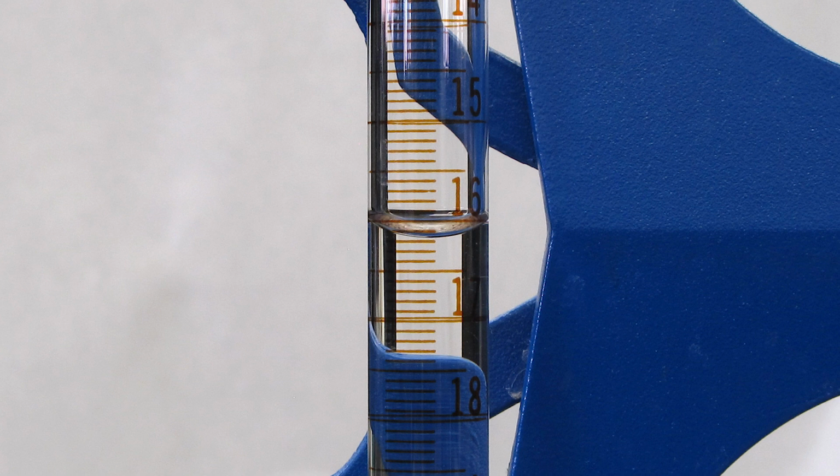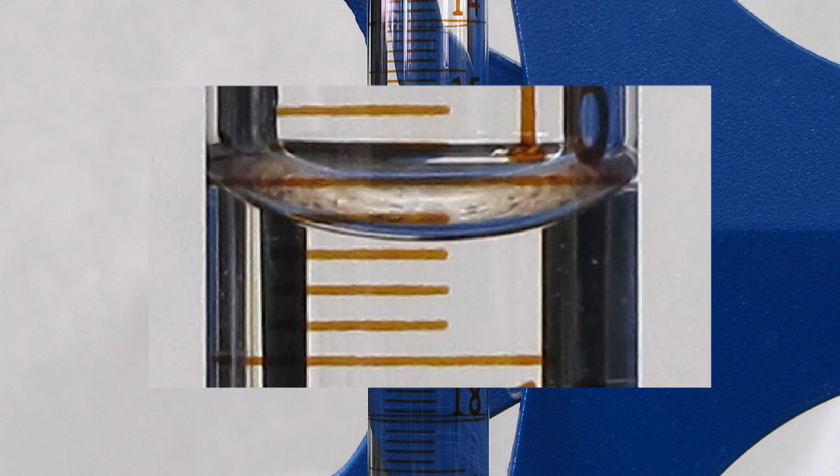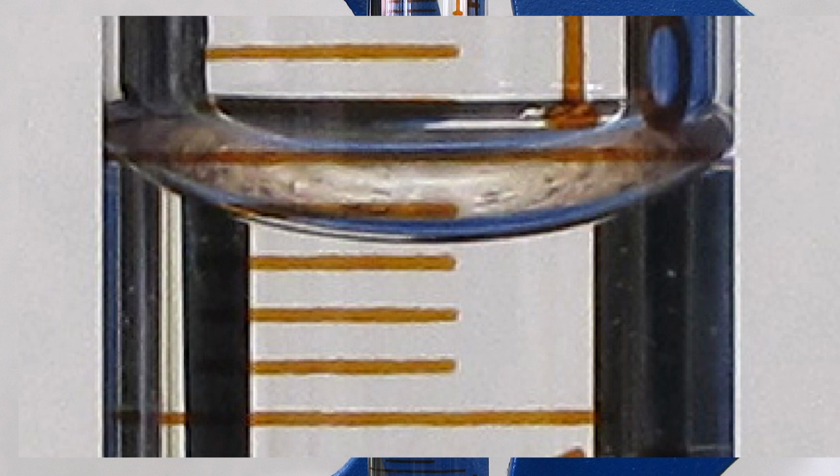This means that, since the actual physical markings are in tenths of a mil, you have to interpolate between them to read in hundredths of a mil. To show you how to do this, let's zoom way in on this Buret. The bottom of the meniscus here comes down to a point between the 16.1 and 16.2 mil marks. And if we use our imagination to divide up the space between the markings into 10 segments, you can see it lines up best with the 16.16 mil marking. So we would record this as 16.16 mil.